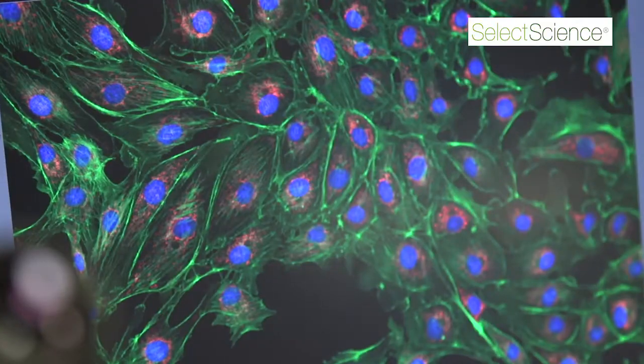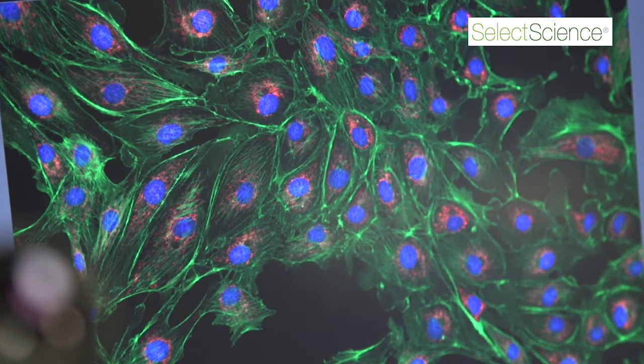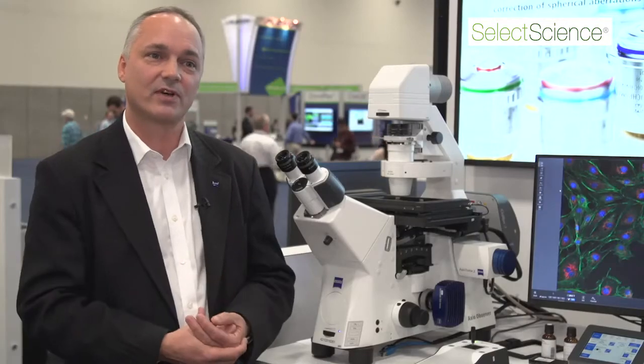We've also designed a new focus stabilization system called Definite Focus 2, which is designed for very long-term time-lapse imaging with stable focus.